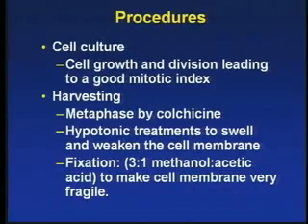So you have to have a way to force the cells to divide, and also a way to stop the cells at mitosis so that you can get a good mitotic index, so that your recovery of the cells that will show the chromosome to you will be higher. Once you have a good growth condition and allow them to grow into the mitotic stage, you have to harvest the cells.